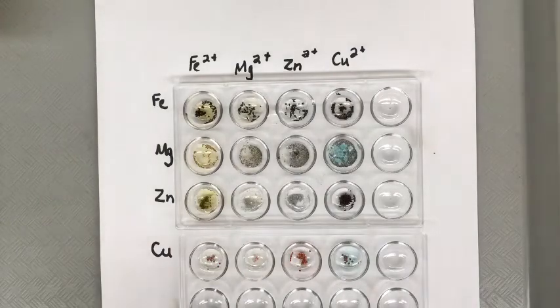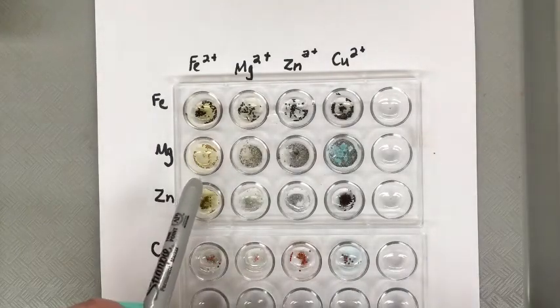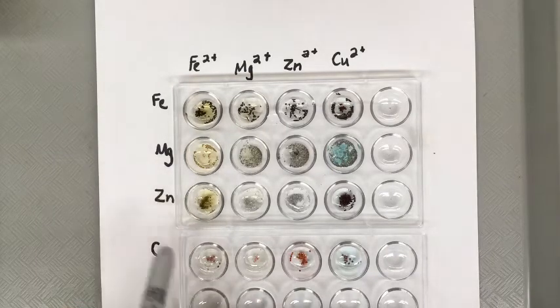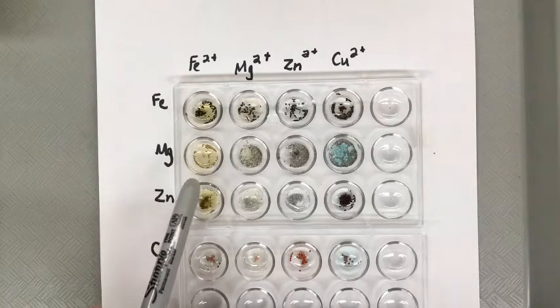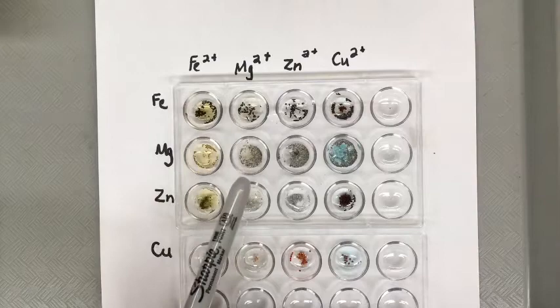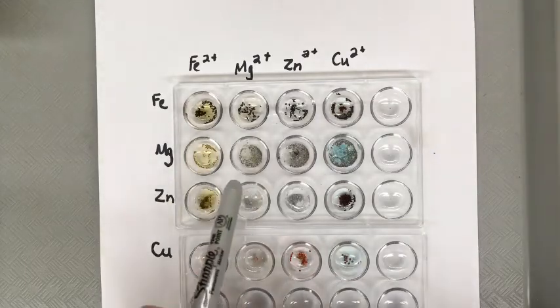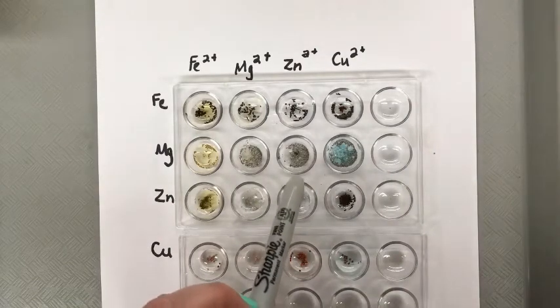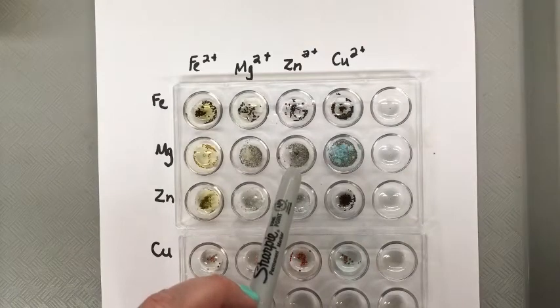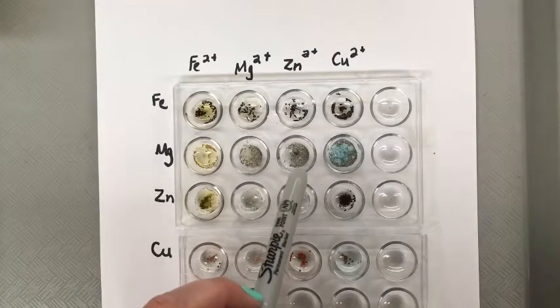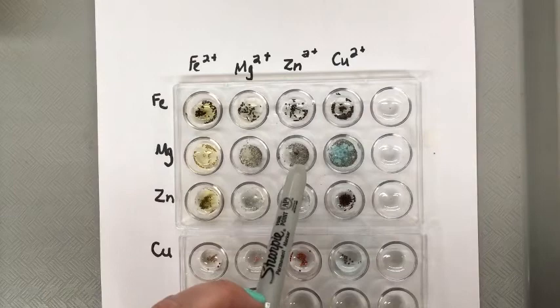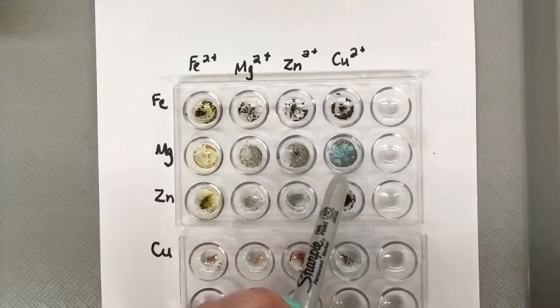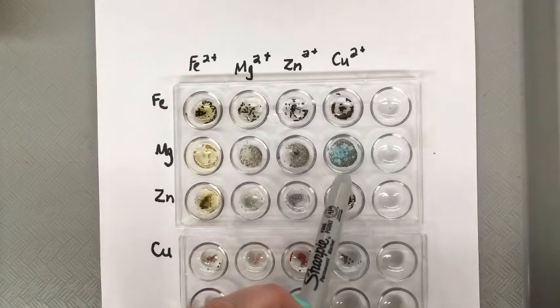Then we drop down to magnesium. You can see that the magnesium particles have changed color. They're not silvery white anymore, they've now turned orangish. So that would be a check mark. Then you move over to the next one, it's magnesium with magnesium, there's no change. When we look at the zinc particles, I think there was some oxidation on some of the magnesium. But if you look carefully, it looks like there's been a couple of bubbles and there is some blackening of some of the zinc particles. So we would say that's a yes. And then finally, over to the copper, there's been lots of bubbling.